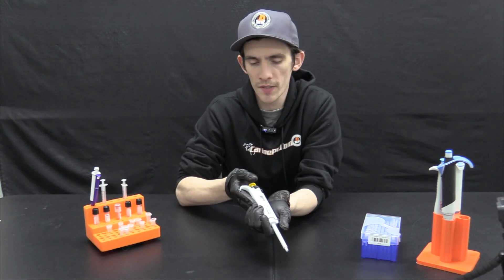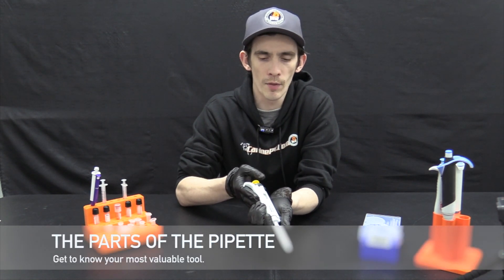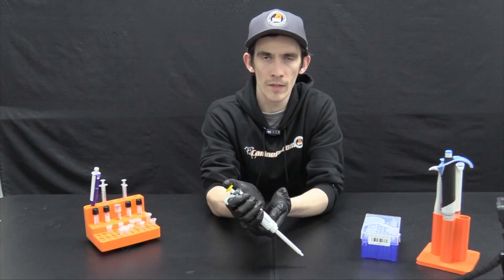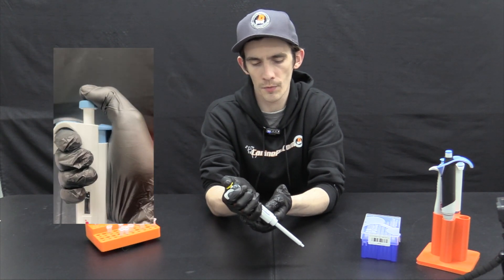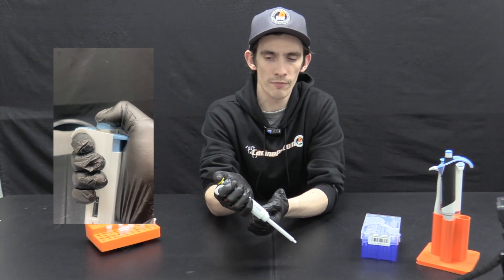First, let's get to know the parts of our pipette. There are many variations of pipette out there, however most if not all of them will have the same corresponding parts. First we have the plunger button on top. Your thumb will rest on top here and this is responsible for aspirating and dispensing the fluid.